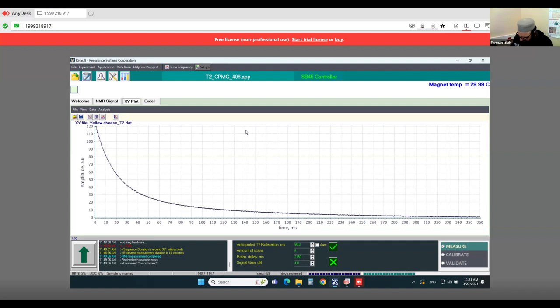When the sample is okay, let me confirm.